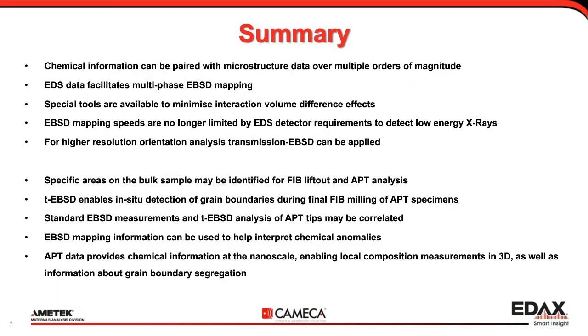So let's summarize the webinar. As you have seen, EDS information can be combined with EBSD over a wide range of scales, from centimeters to atoms. And this EDS data not only facilitates discrimination of phases with very similar patterns, it also enables successful analysis of materials with up to 10 or even 15 phases.